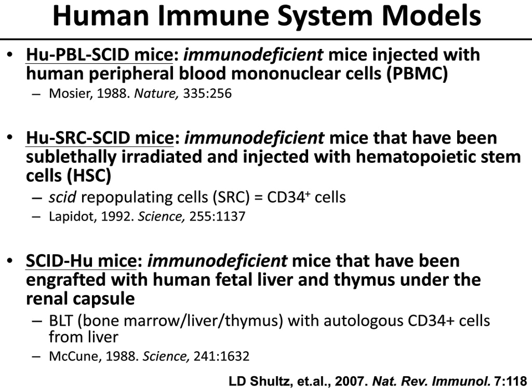But you also have a short window of time where you actually can study human immunity in the BLT mouse model. So what I'm going to do next is basically walk you through examples of each one of these three models and tell you a little bit about how we're using them to study human immunology.